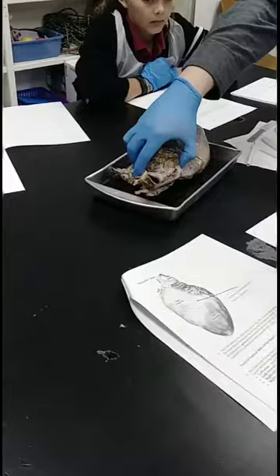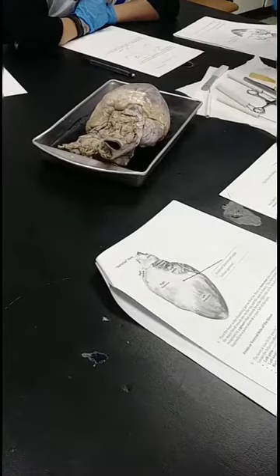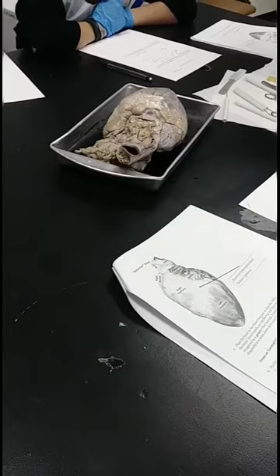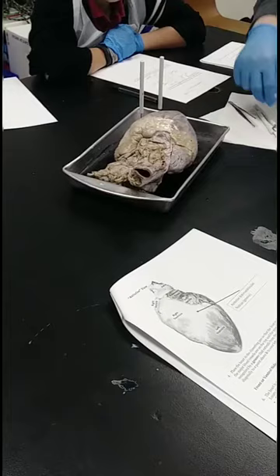This right here. Now you're going to use your probes. So open it up and find the pulmonary vein and pulmonary artery. So let me get my second glove on. That's what these are for. So these are your probes, right? You also have some pins. You have your scalpel.